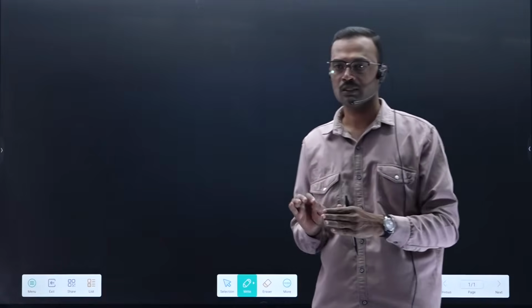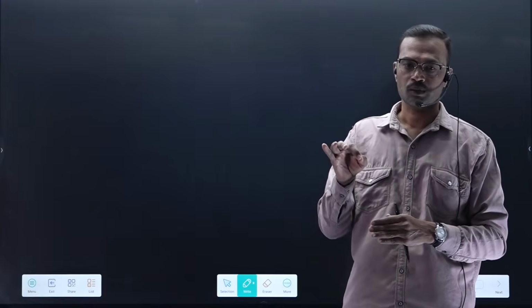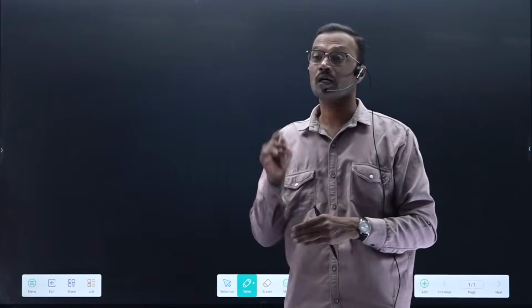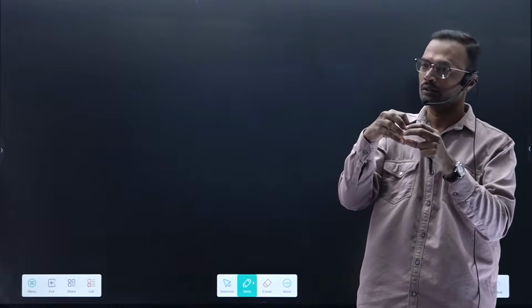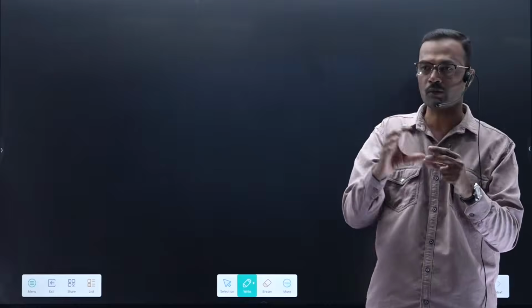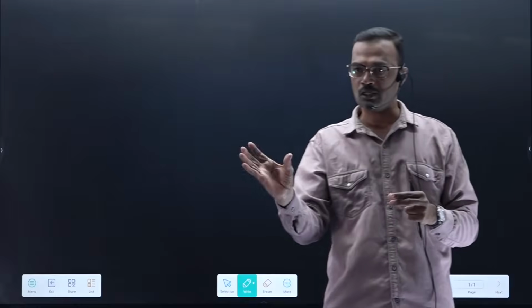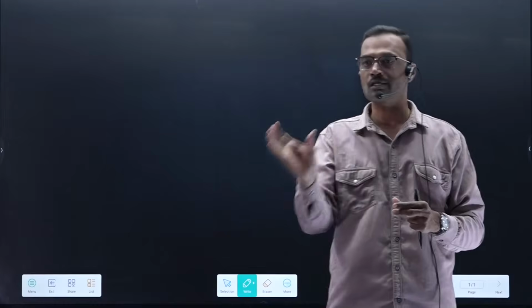Now the question is, between inorganic and organic samples, initially, which molecules are found to be stable? Organic is stable, right? When organic is stable, a beam of electrons is going to come and collide with the gaseous sample. They may lose one electron, then form unstable ions. Initially stable, then unstable, more fragmentation. But what about inorganic? Initially unstable, then it is stable.